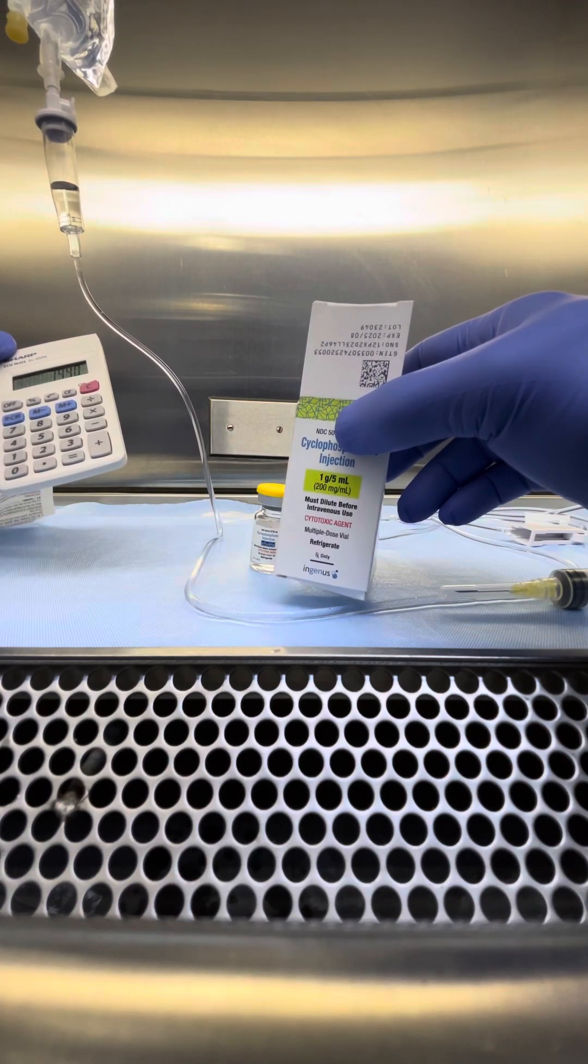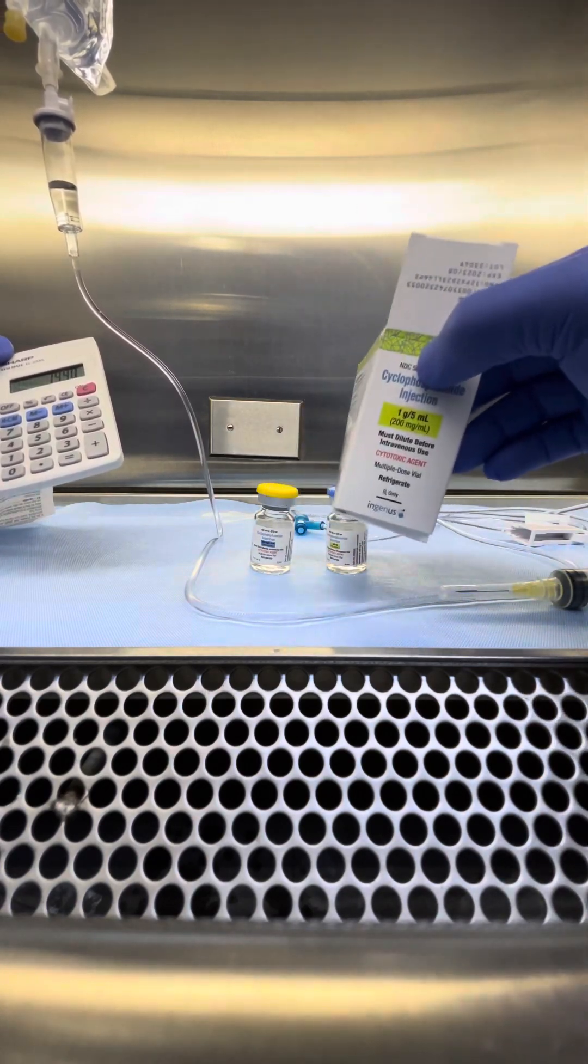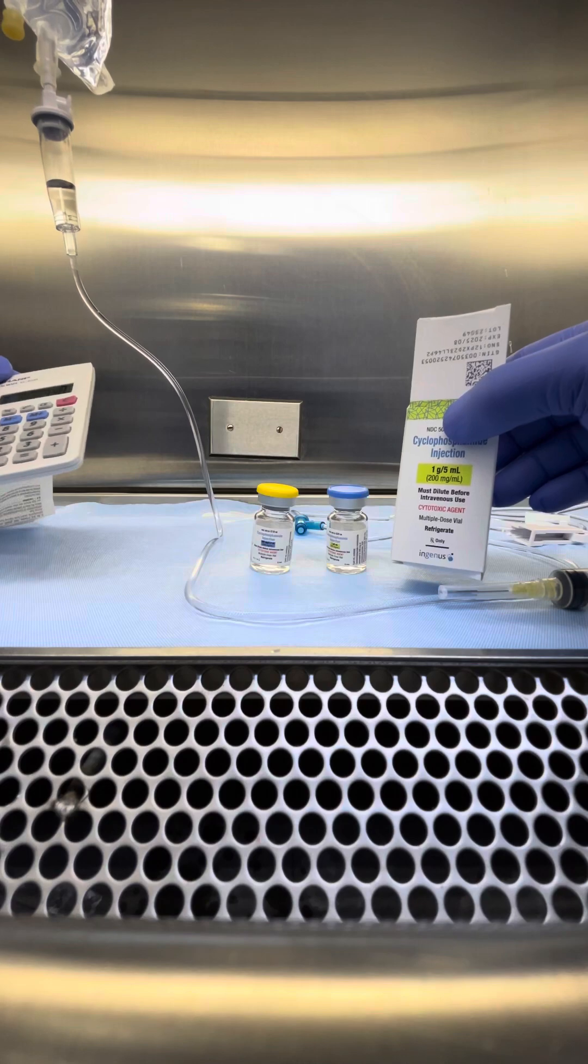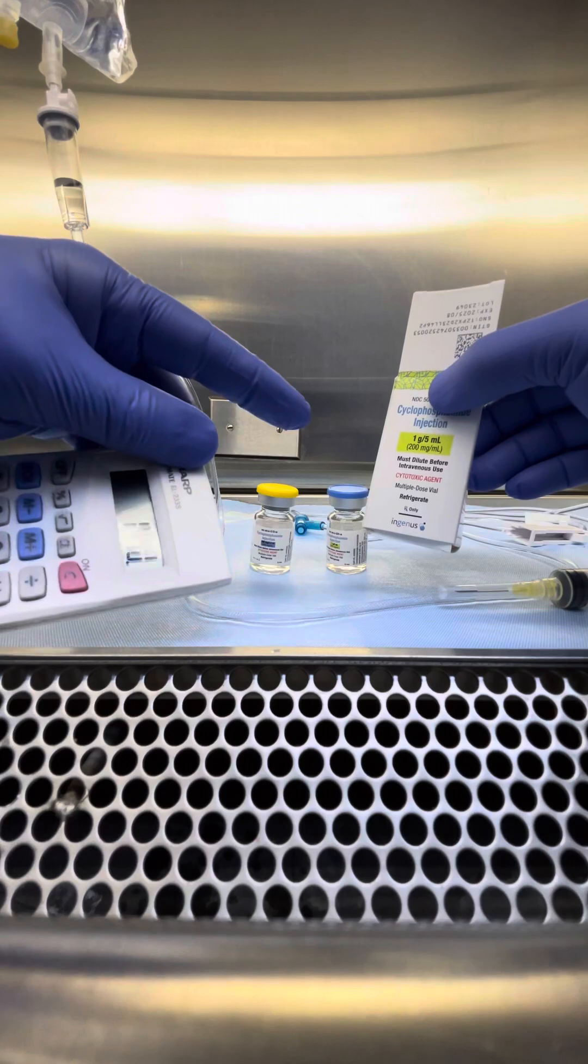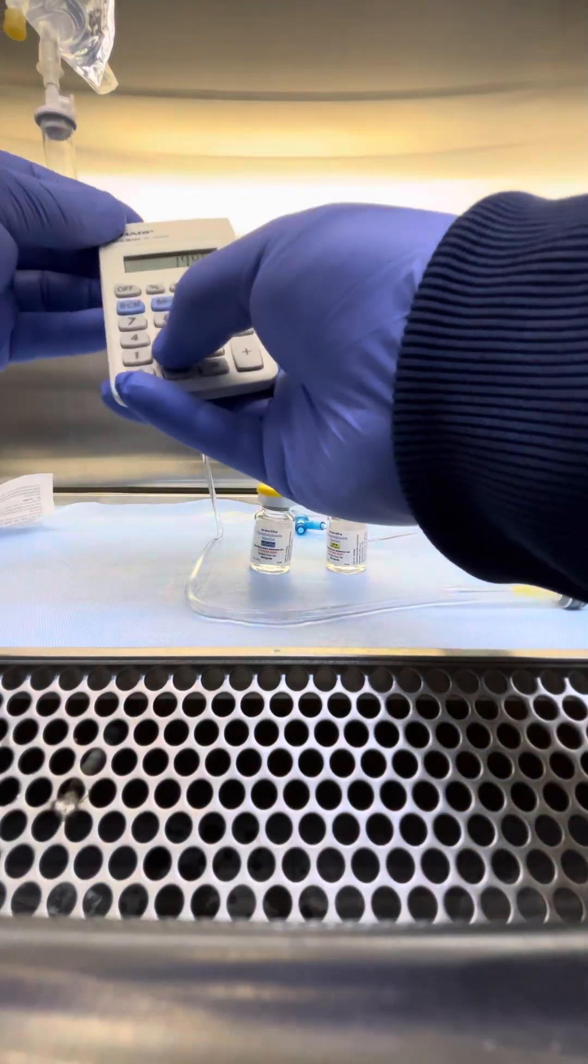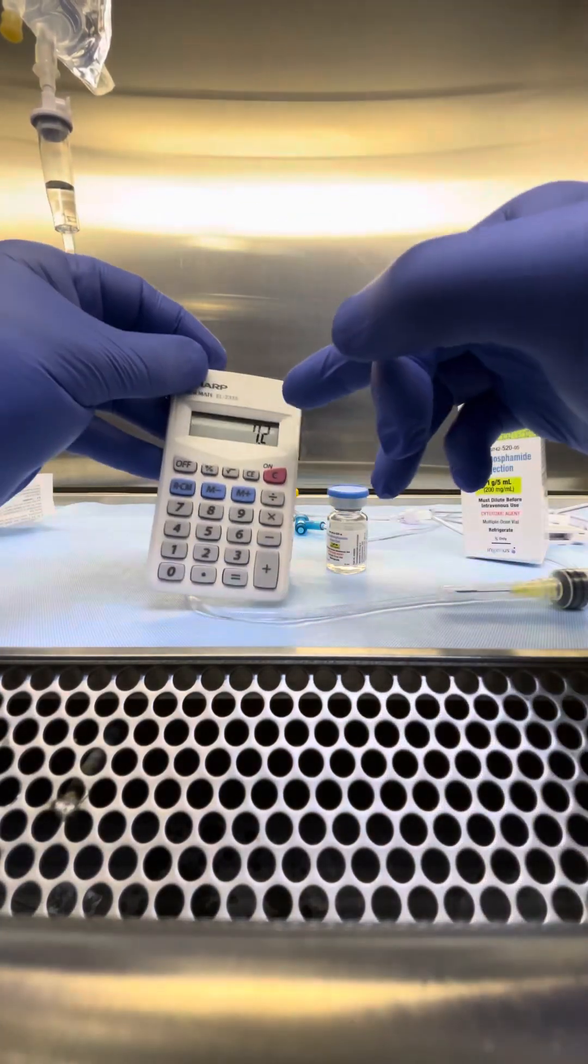Here, it says 200 milligrams per ml. These come in different concentrations. This one, these two are the same concentration, and I do not have to reconstitute it, but we dilute it in the bag here. So, 200. That gives me 7.2 ml.